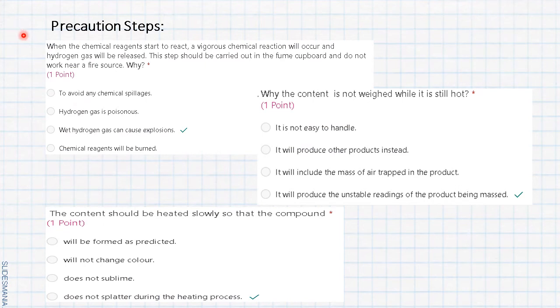For the precaution step, you can get some hints from the pre-lab question. The first one is regarding the reaction: we have to conduct it in the fume cupboard and do not work near a fire source. Why? Because the reaction between zinc and hydrochloric acid will release hydrogen gas, so the wet hydrogen gas can cause explosion.